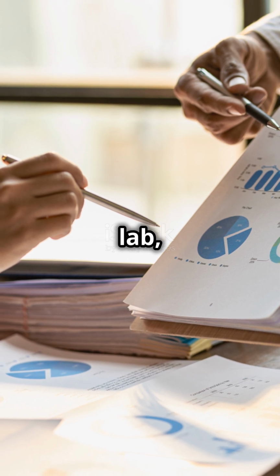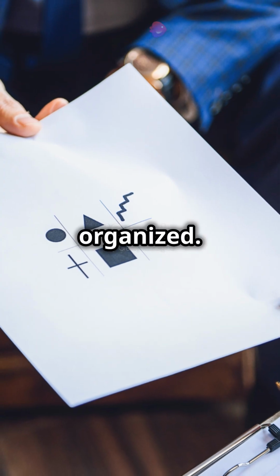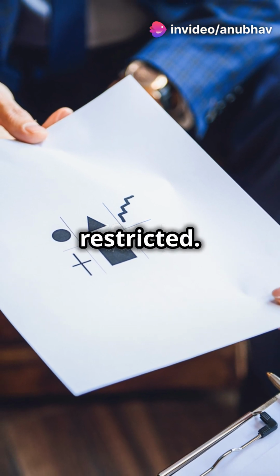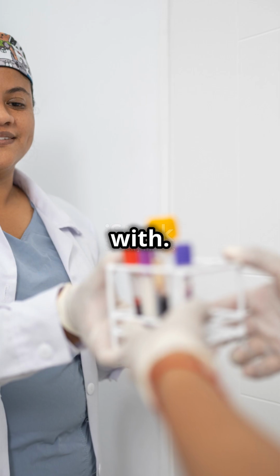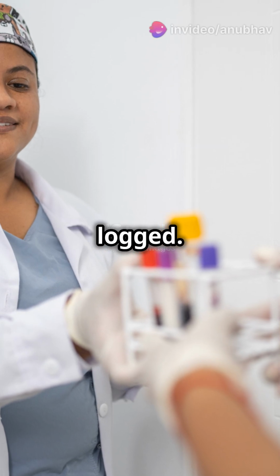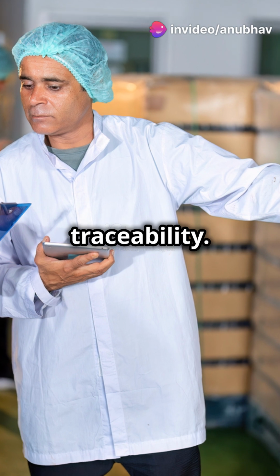In the lab, have a designated storage area that's secure and organised. This area should be monitored and access should be restricted. Only authorised personnel should have access, ensuring that samples are not tampered with, and each transfer within the lab should also be logged. This adds another layer of security and traceability.